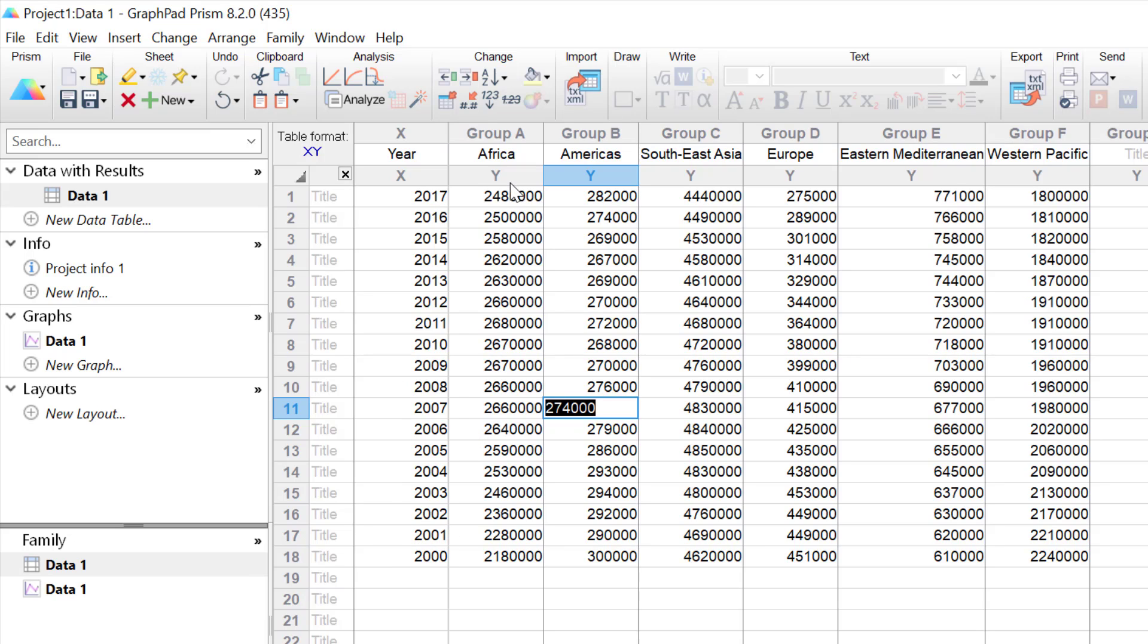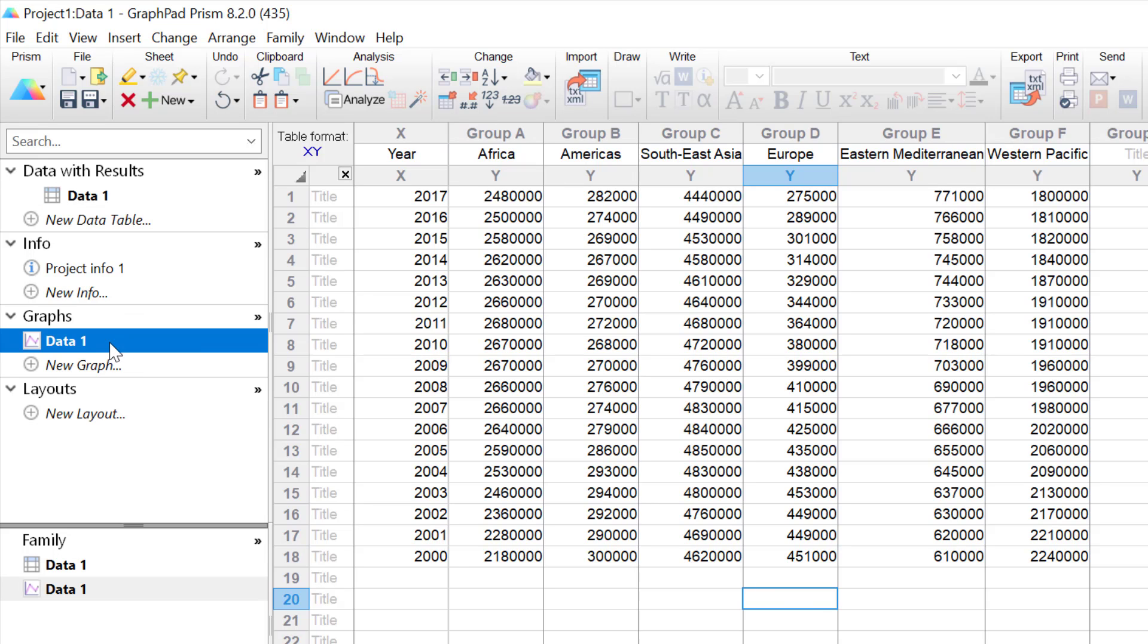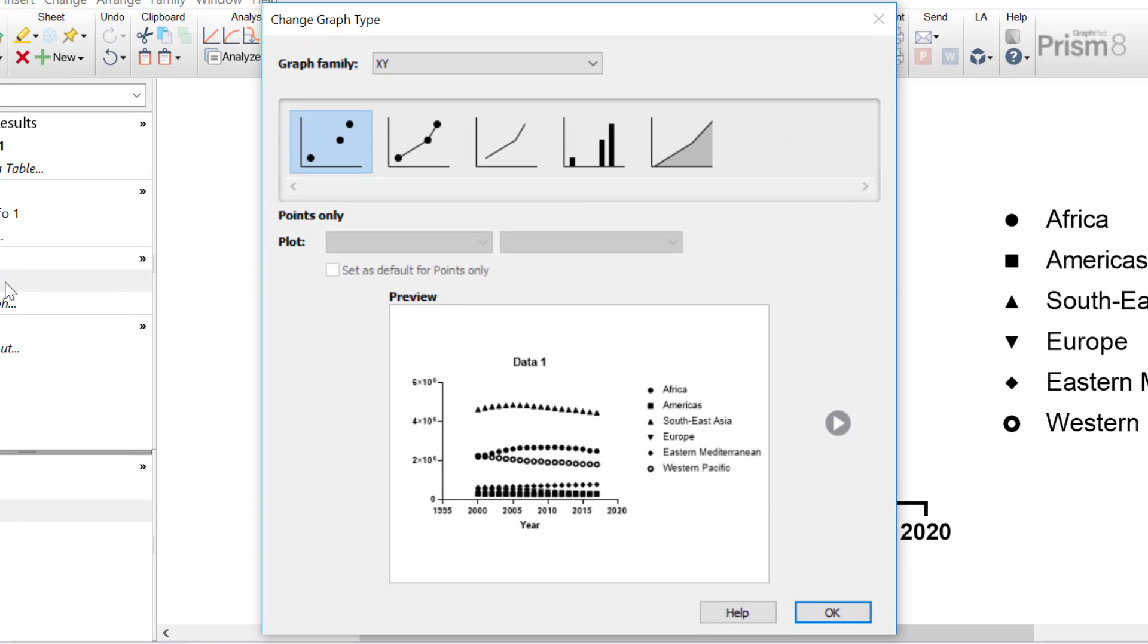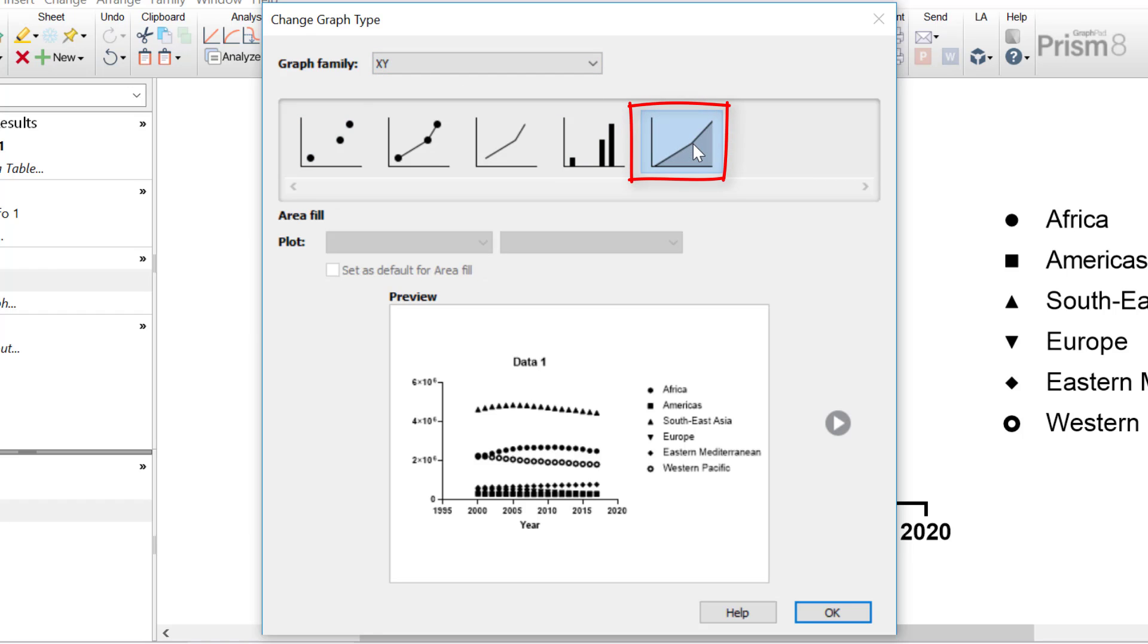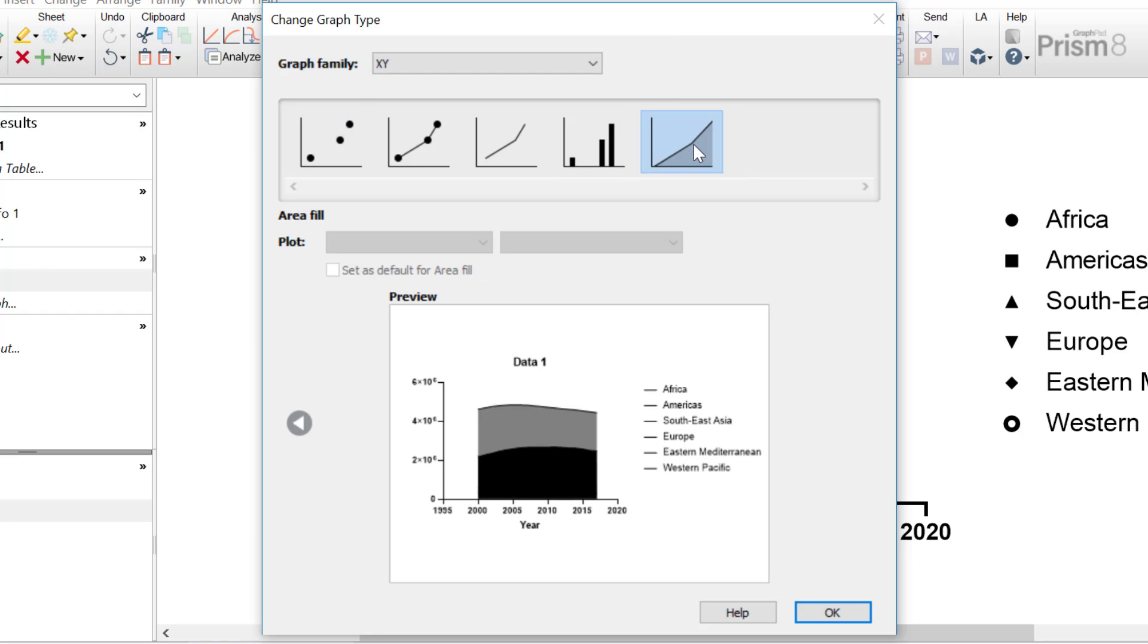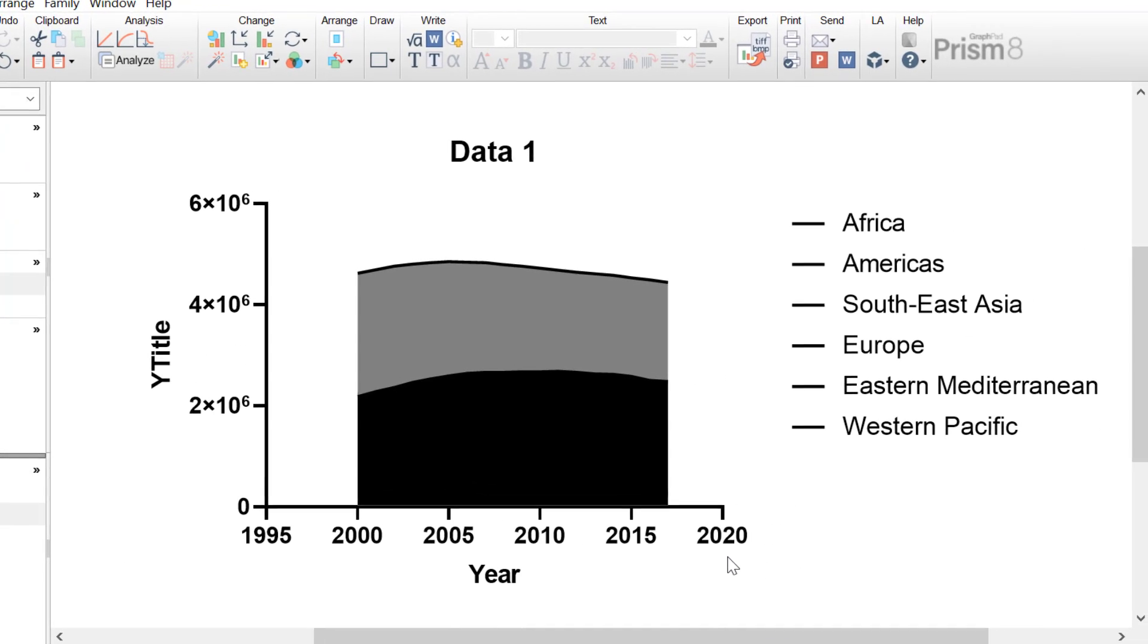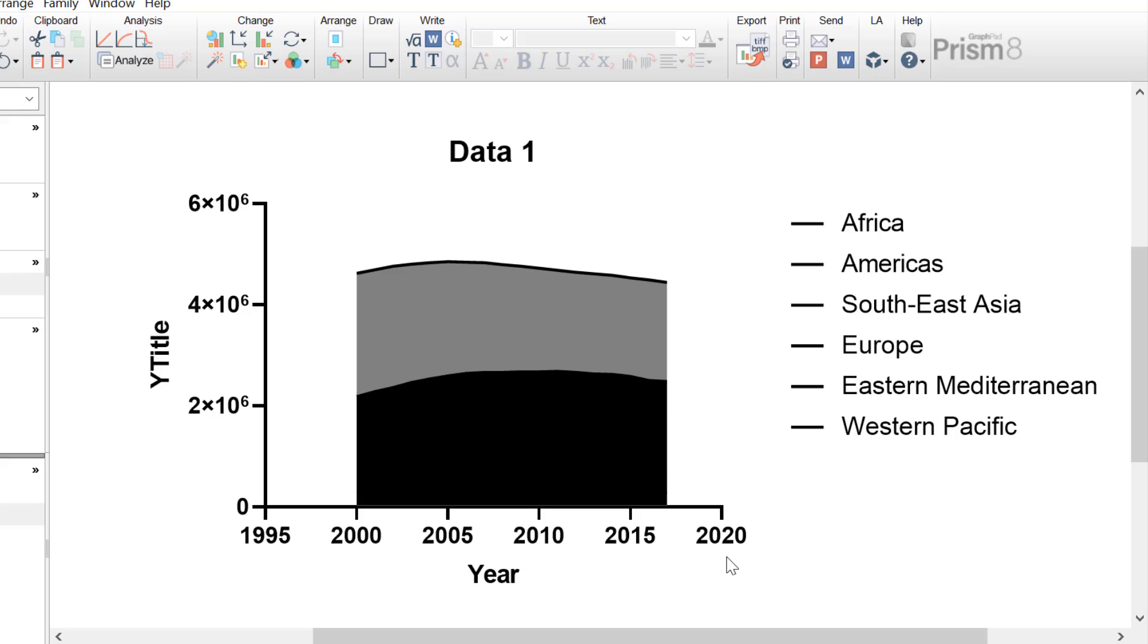So to create an area graph, you want to now click on the graph on the left-hand window. This will open up the graph wizard. Specifically, for an area graph, you want to ensure the X, Y graph family is selected. And the option on the right-hand side is the area fill option. So this is the area graph. I'm going to click the OK button. Currently, the graph looks very strange, and that's because it needs some formatting.